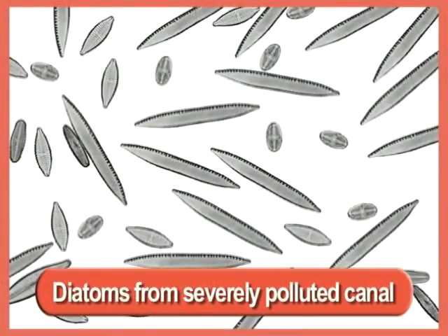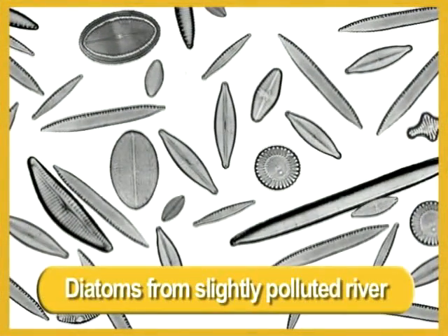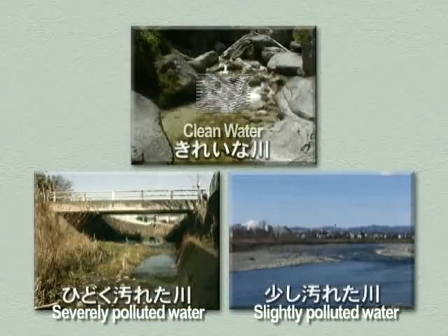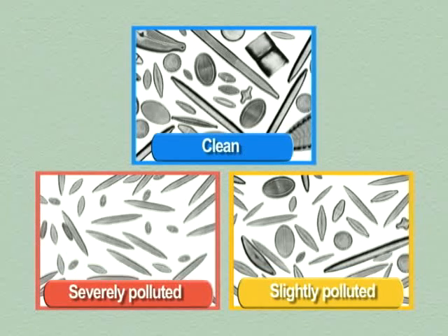First, we will look at the diatoms from the severely polluted water — their shapes are generally the same. In the slightly polluted river water, several shapes are present including oval and crescent. And finally, the clean water diatoms: in this water, a wide variety of sizes and shapes are found, meaning many different species of diatoms live there. From this experiment, we can see that water quality can be assessed according to the variety of diatoms that live there.